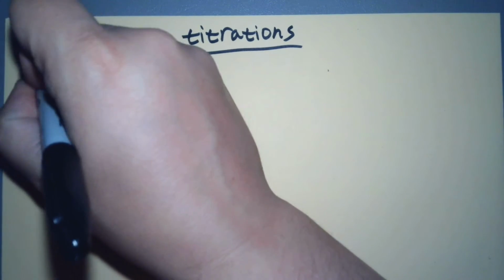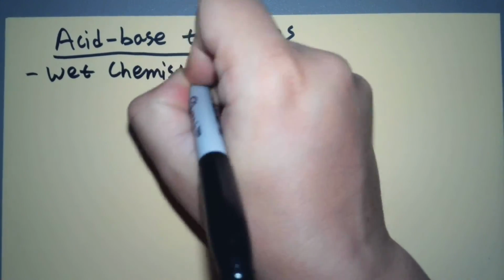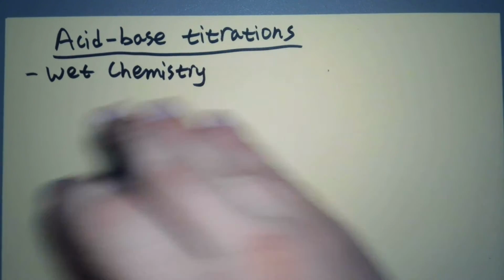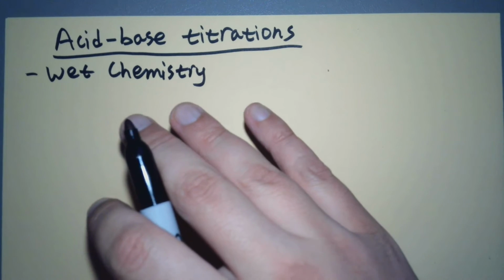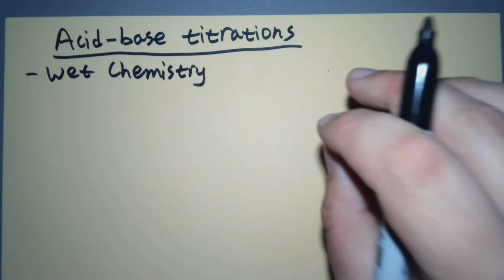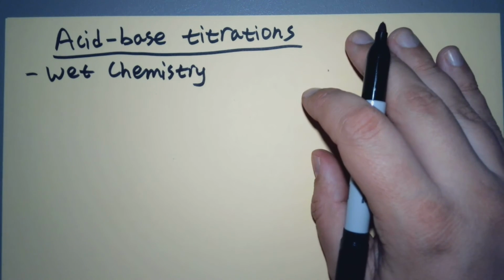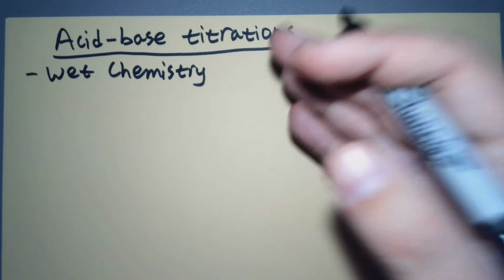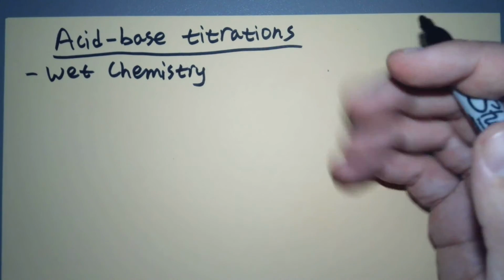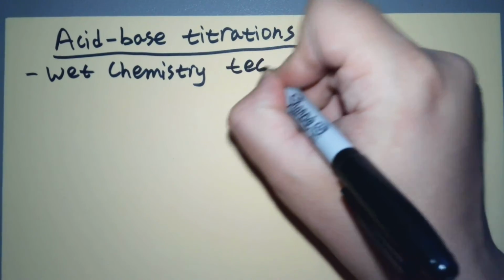This is what we call a wet chemistry technique because it works with water-based solutions, aqueous solutions, so we call it. It's not computational. It's not a really specific piece of electronic equipment. It's really just putting together aqueous solutions and looking for some sort of indicator color change. That's really what it boils down to, and so we call it a wet chemistry technique for that reason.